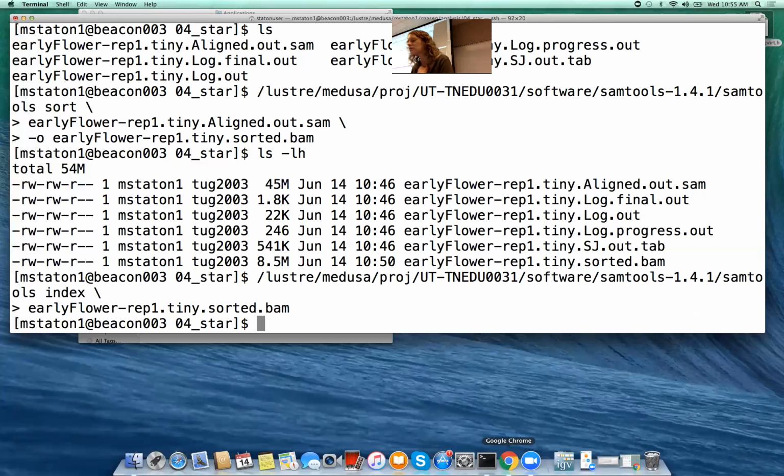You can also, if you zoom way in, let's zoom in on just a piece of an exon, we can actually see variants. This is the peach reference genome, and at this location, the peach reference is a T. Every single one of our reads is a G. So we know this is a SNP. This is some kind of difference between our apricot data and our peach reference genome. So you can zoom in and out and see how different your reads are.